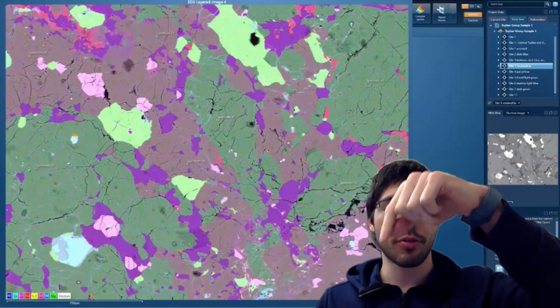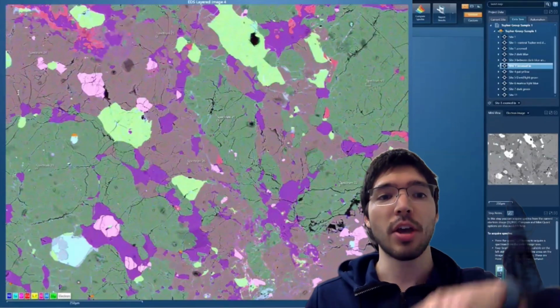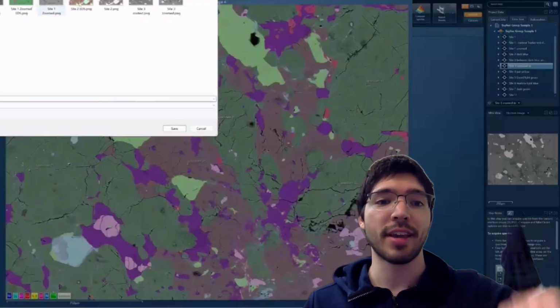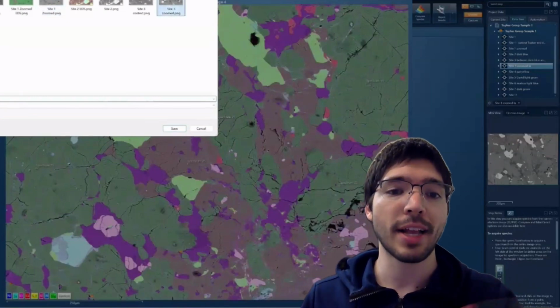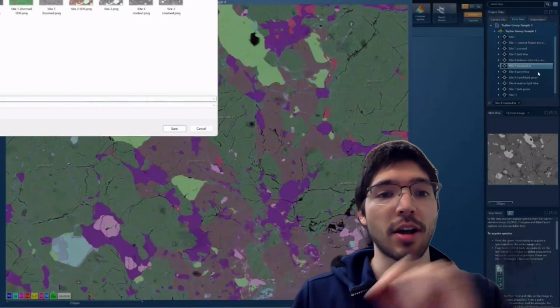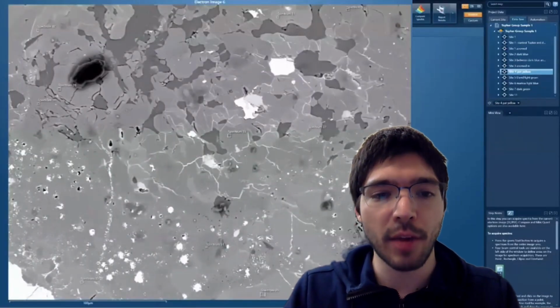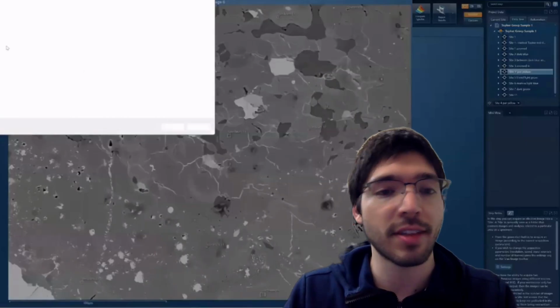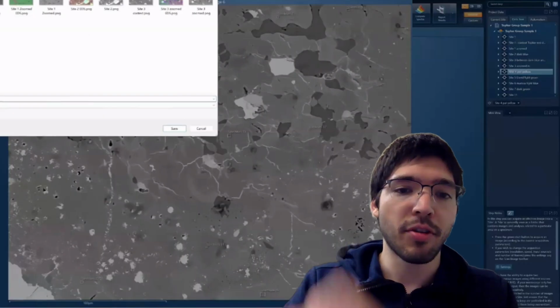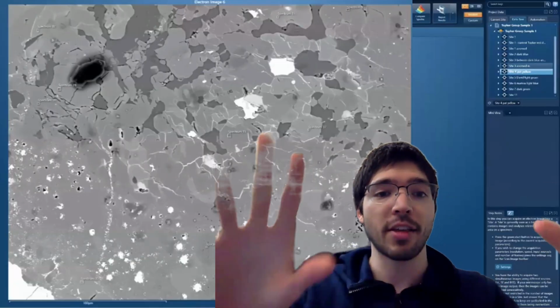So those electrons are going to more than likely be elastically scattered back upwards, where they then get picked up in the detector. And depending on the intensity of how many of those backscattered electrons have been picked up, that correlates to a signal, which correlates to essentially a black and white contrast value from 0 to 255. The simplified way to explain this is that a backscatter electron can tell you the average Z value in your sample, which essentially means materials that are rich in high Z elements like iron, nickel, cobalt, like metals, are going to shine as bright white.